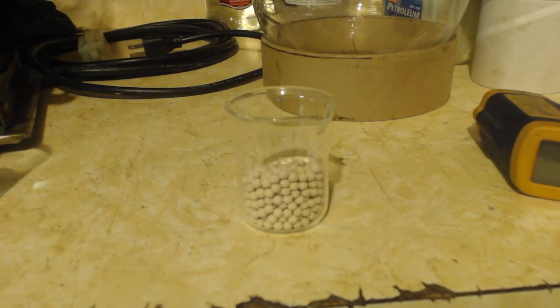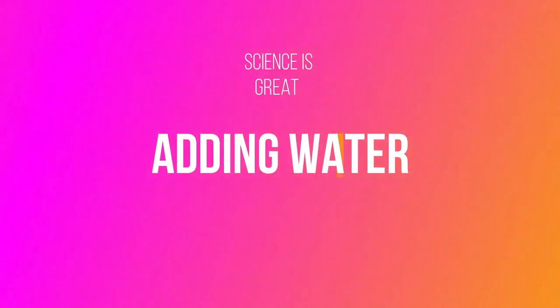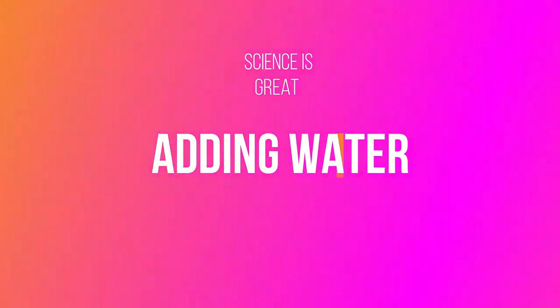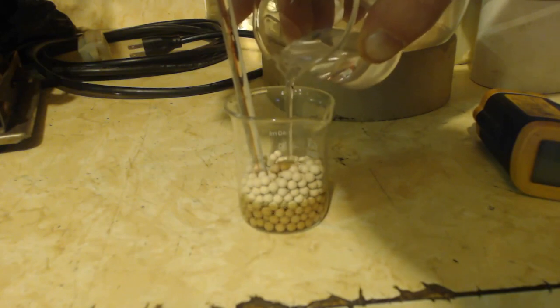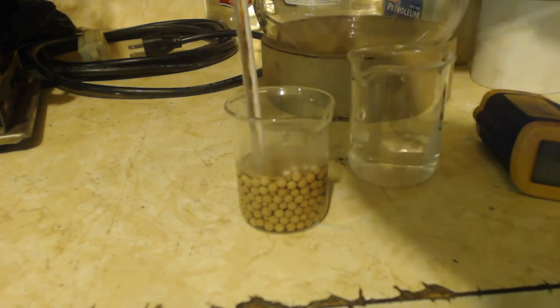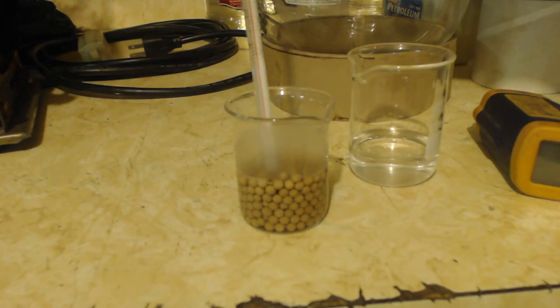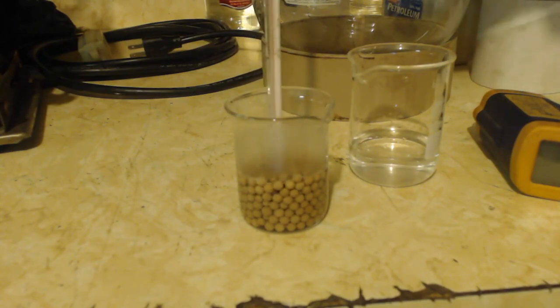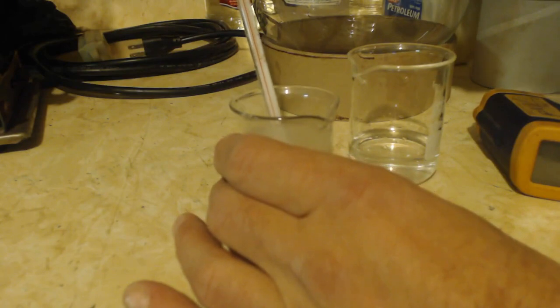Alright, I'm going to do what Nerd Rage did in his video. See if this spikes. Holy crap. Yes, it spiked. Went from 10 degrees to 30 degrees and it's still going up. We'll come back and see how much that is later on. It's 35, 36.